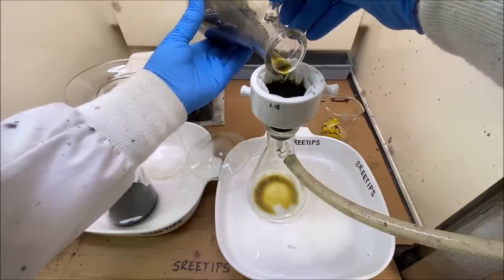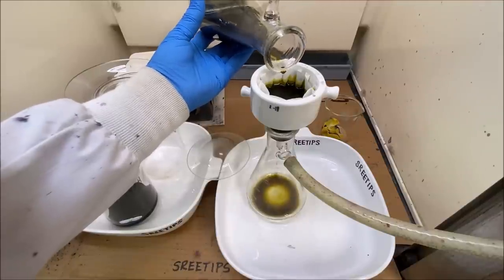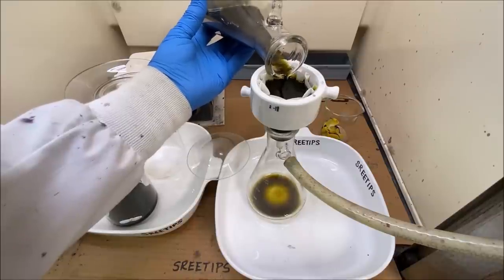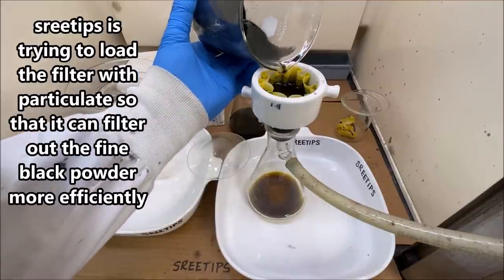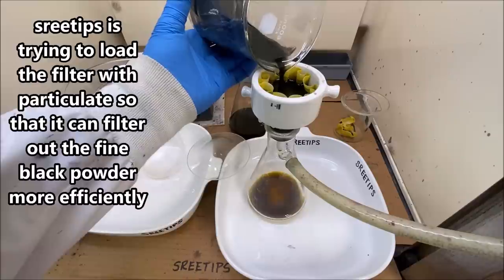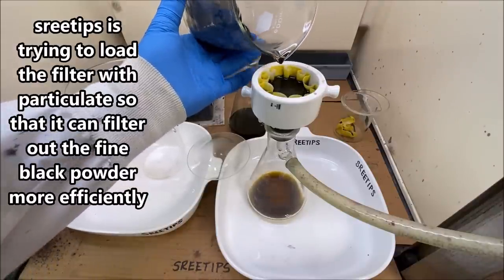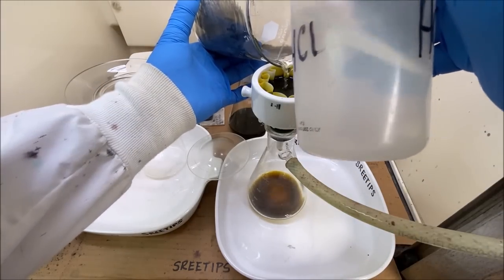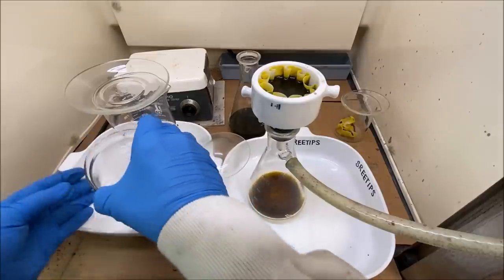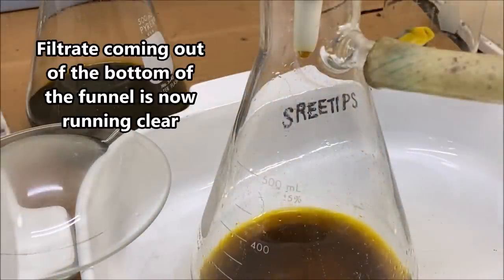Of course, it's going to pull right through the filter. Particulate is so fine, it just goes right through the filter paper. I'm going to add a little of this black stuff, see if that starts pulling through the filter, or if the filtrate stays nice orange color. That liquid appears to be free of particulate.